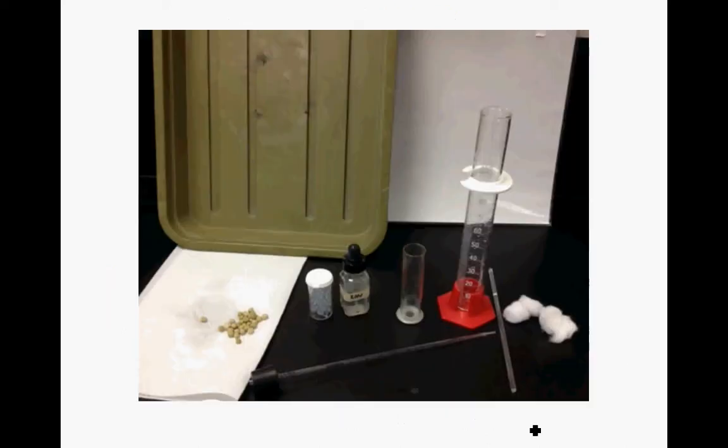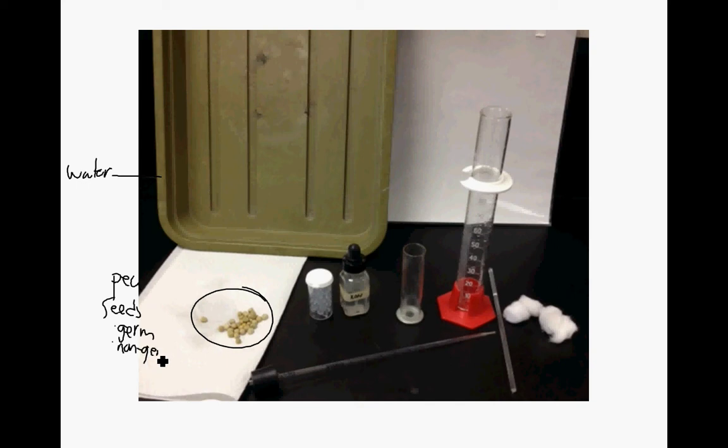I showed you in class what the materials are basically going to look like. We're going to have a green tray right here, which we've seen before, and we're going to put water in that green tray. Here is our organism, and these are going to be pea seeds. We're going to have some that are germinating and some that are non-germinating. Here are the glass beads. This is the potassium hydroxide.